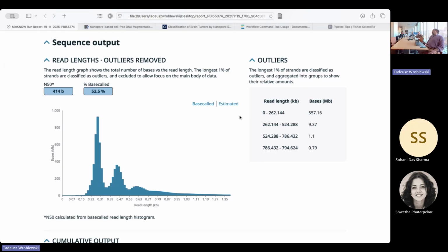So this is a consideration for rapid field sequencing in particular. If you're doing not this experiment, but field sequencing, and you need to do it rapidly, this would be a consideration. Sequencing for the Minion, that's what you mean? Or using the P2 Solo, the same platform.